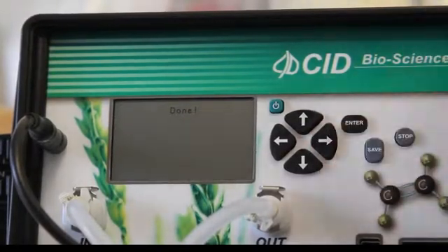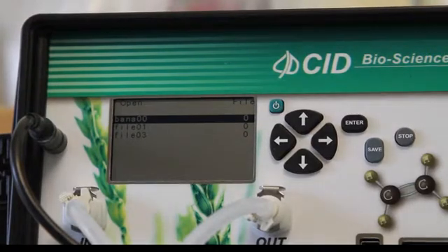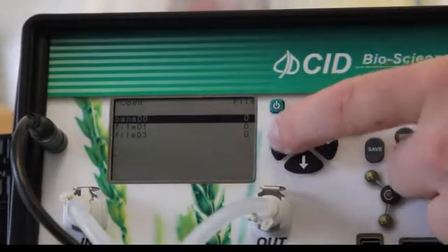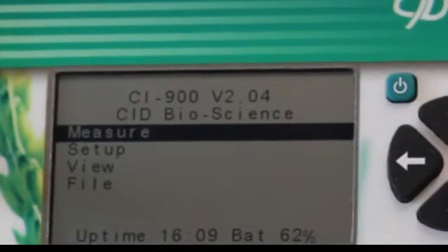When the word Done appears on the screen, this confirms that our file is ready for measurement. Now to start using the CI900, we go back to the main menu, select Measure, and use the right arrow to open.